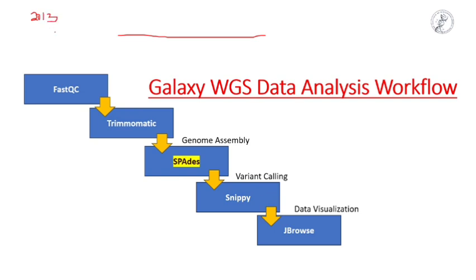A newer assembly is there, but I think it is not a full one. This is the 2013 one we are using. So, using the reference human genome, we will assemble all our fragments and find out which fragment will come after this fragment, and which after the next. Based on the reference genome, we will stitch all our fragments together to form the whole genome.